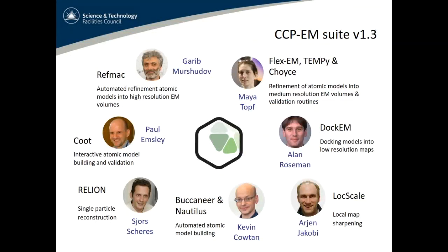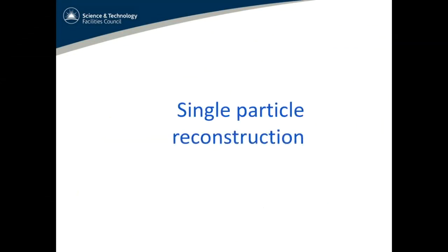So a quick overview of what's in Ccp-Em, the main packages that are in there now. I'll be going over all of these, so I won't dwell on this slide, but just show you there's a range of people involved. It is a true collaborative project.